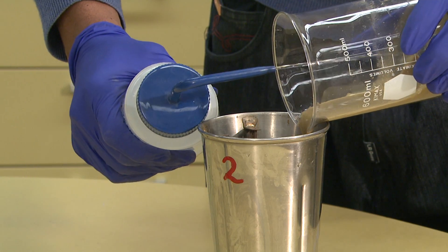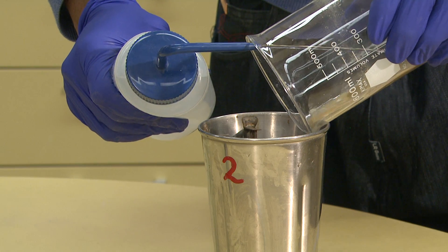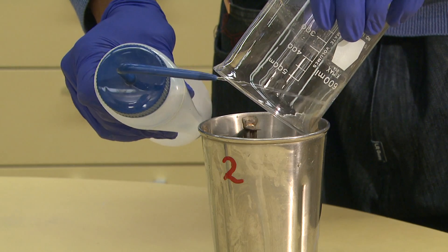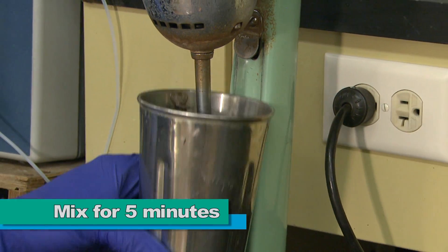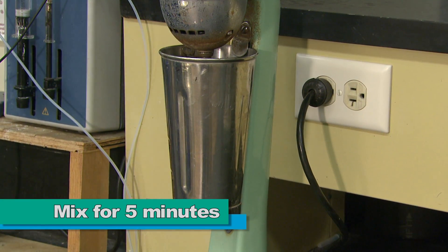The sample is then allowed to sit overnight to ensure complete saturation by the dispersant. After overnight saturation, the soil solution is poured into a mixing or blending cup, making sure to rinse all soil particles into the cup. The cup is then placed onto a malt mixer or blender and stirred vigorously for five minutes to disperse the sample.